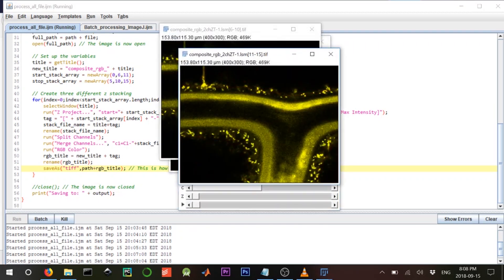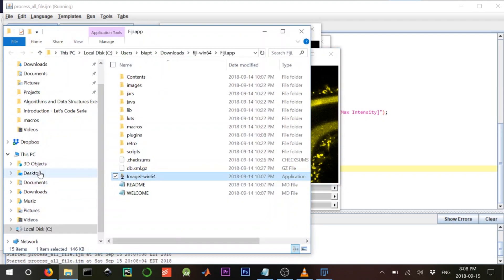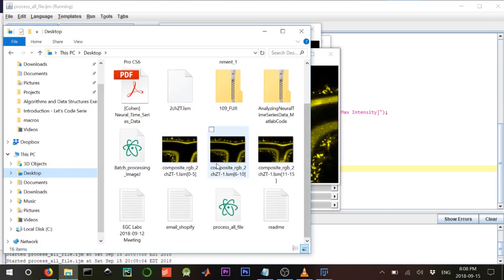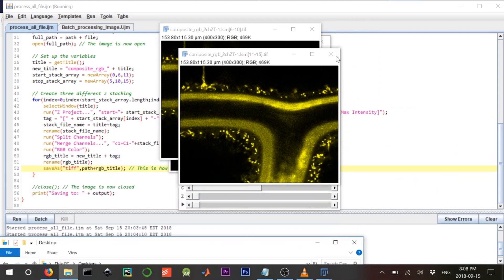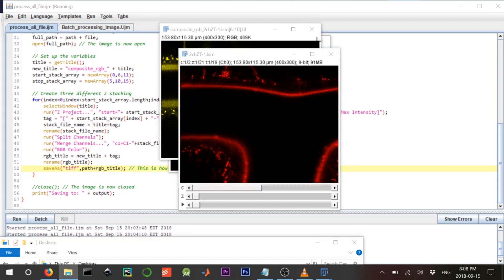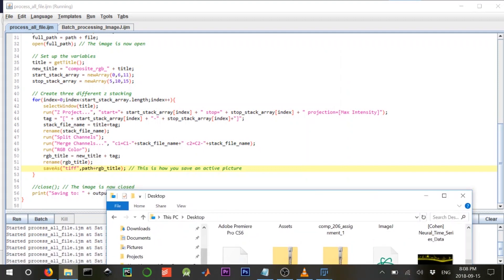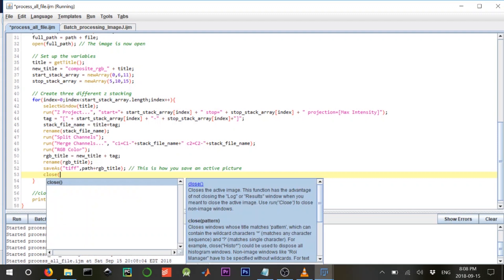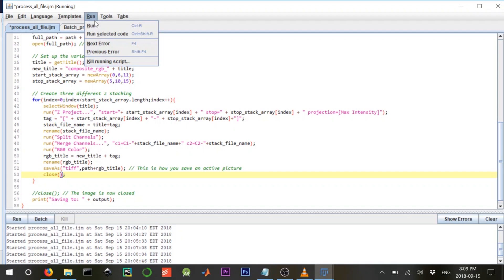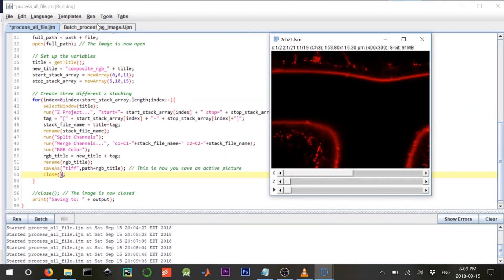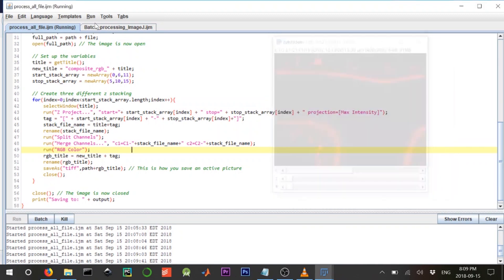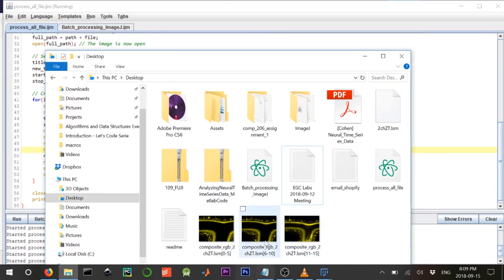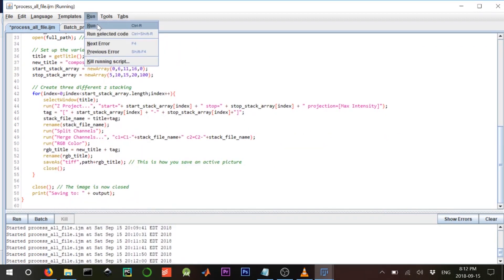All the files are saved — if we look at the desktop, there they are, exactly what we were looking for. But if we have thousands of files they'll keep popping up and might crash the PC, so we want to close each file as soon as we're done with it. We close the active file each time through the for loop. Running it again, they come and go, and at the end only the output files remain on the desktop.